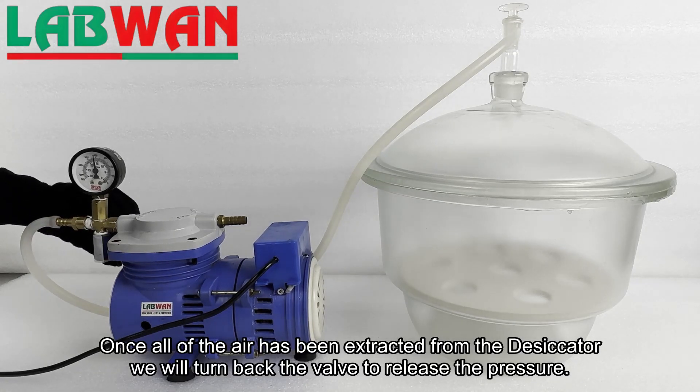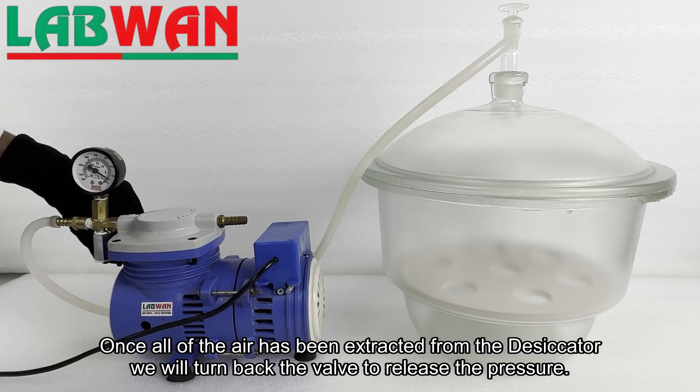Once all of the air has been extracted from the desiccator, we will turn back the valve to release the pressure.